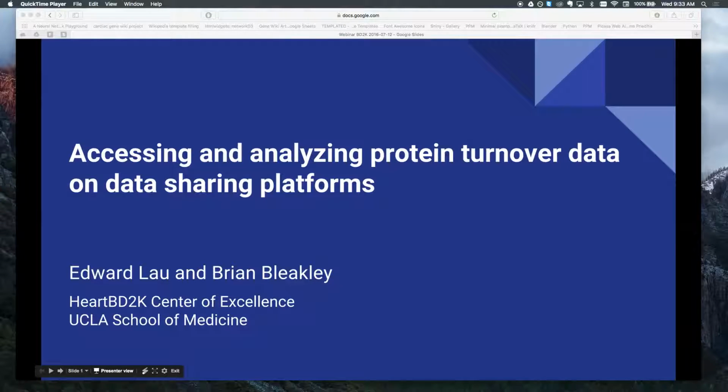My name is Edward Lau, and I'm here with my colleague Brian Bleakley from the HeartBD2K Center of Excellence at UCLA. In this webinar, we'll give a tutorial and demo on how to locate, access, and analyze a protein turnover dataset that was acquired at our center and recently made available to the public.